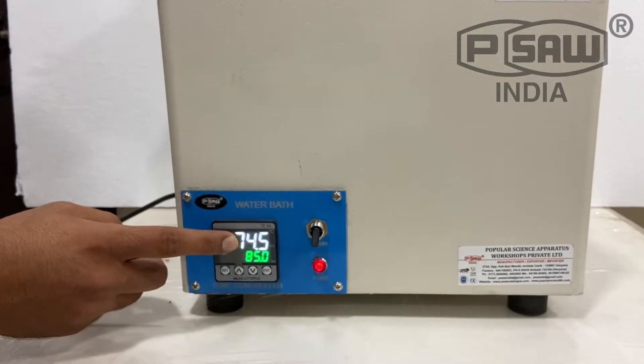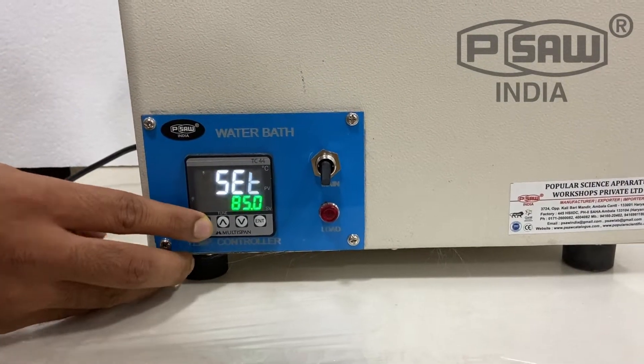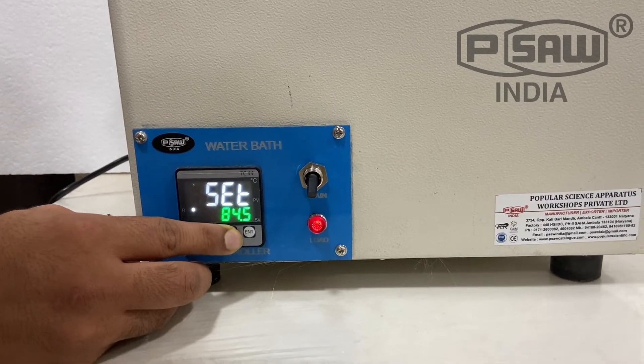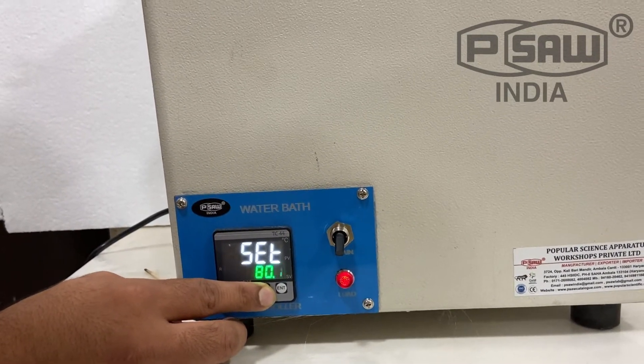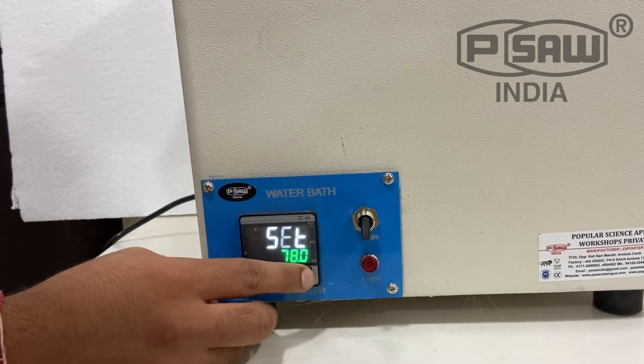This is the set value and this is the current value. For lowering the temperature, press the set down button. Suppose we want to set it at 78, then press enter.